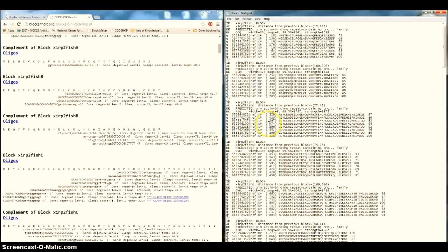But there is another website, Clustal Omega or W2, which shows us the alignment result in more detail, whether it's perfectly matched, half matched or less than half, and it will help you choose exactly your place. But here it's also not bad.